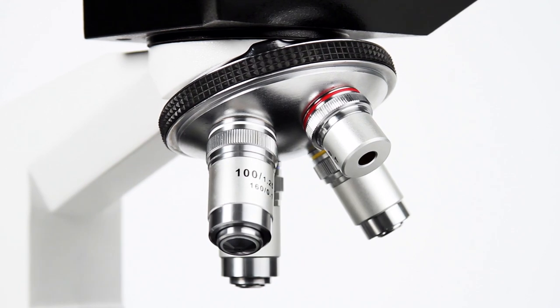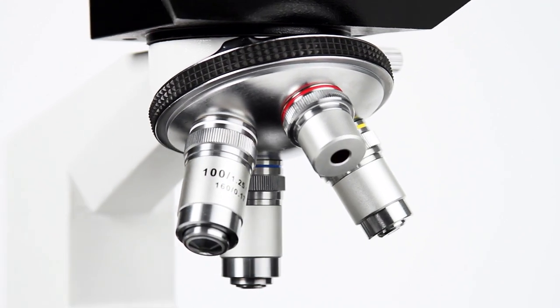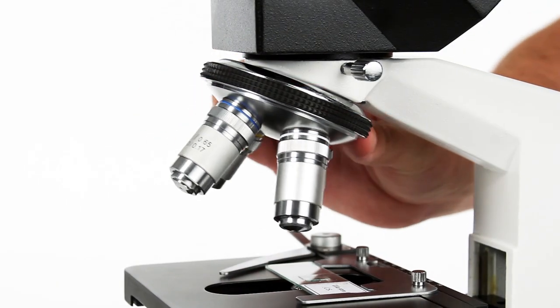Inside, you'll find Celestron's signature optics. All glass objectives provide sharp views with excellent detail.